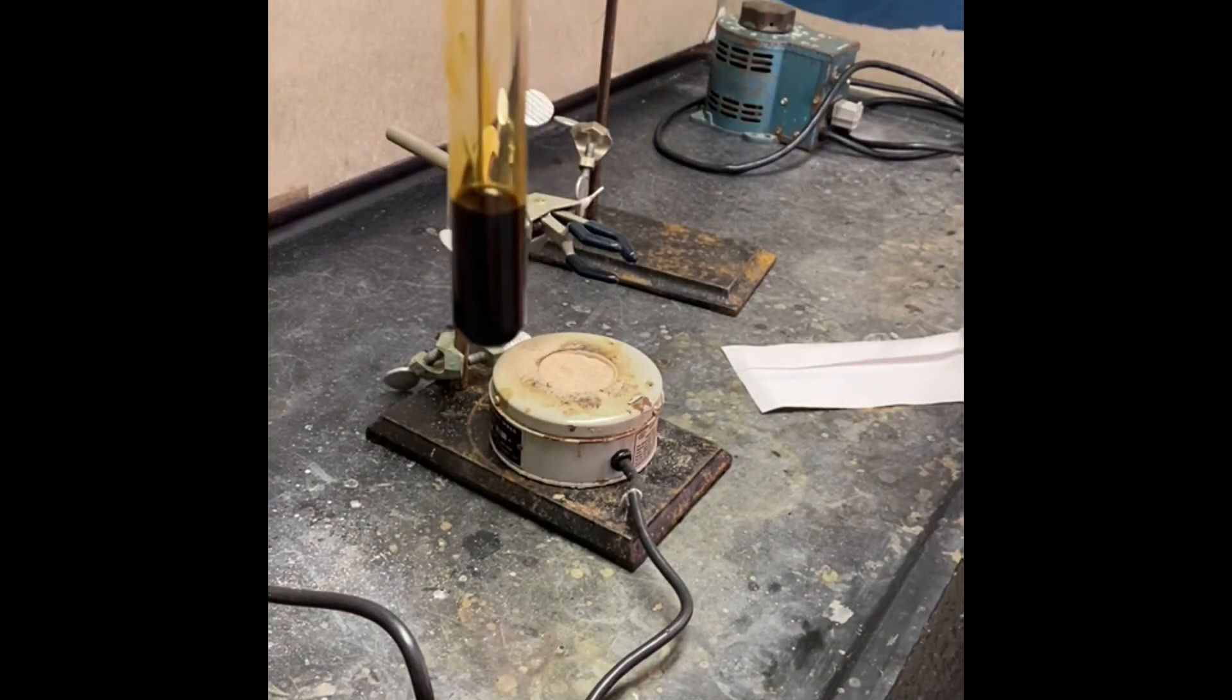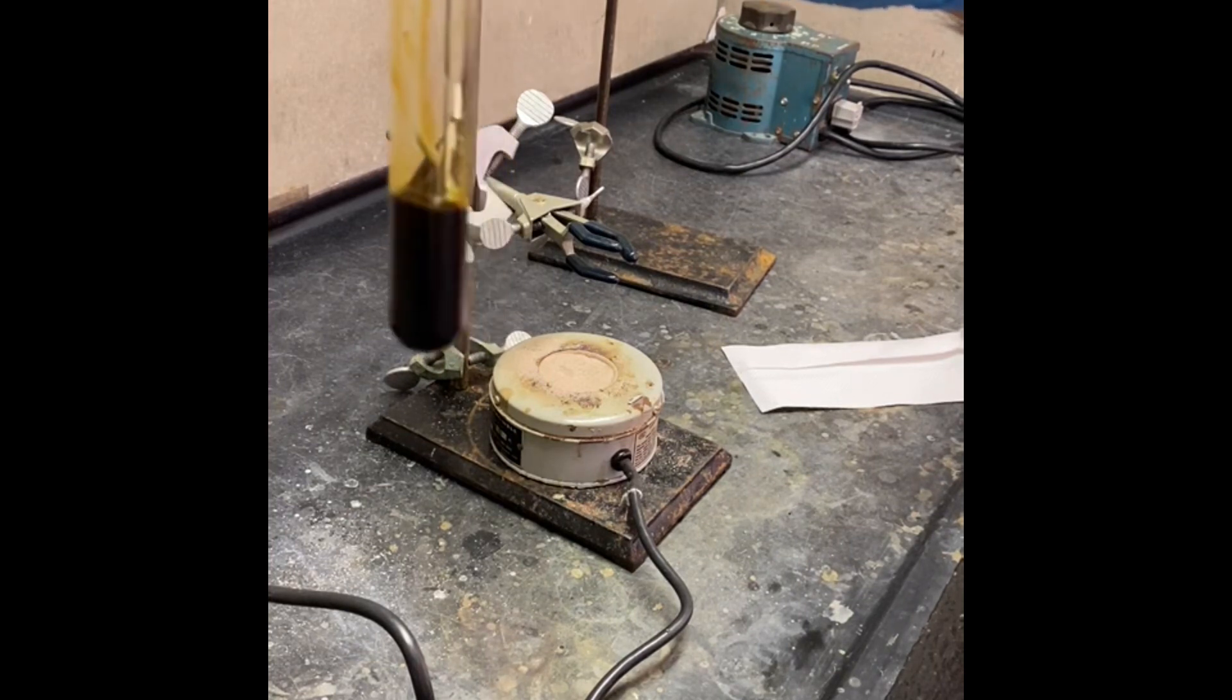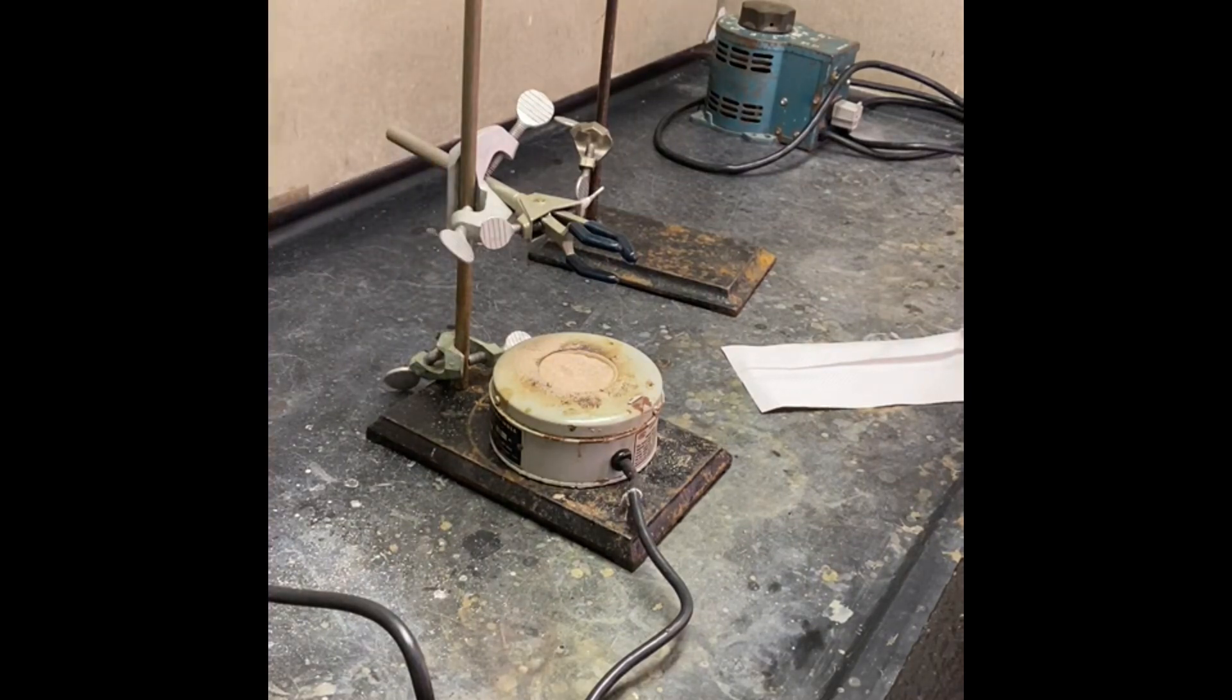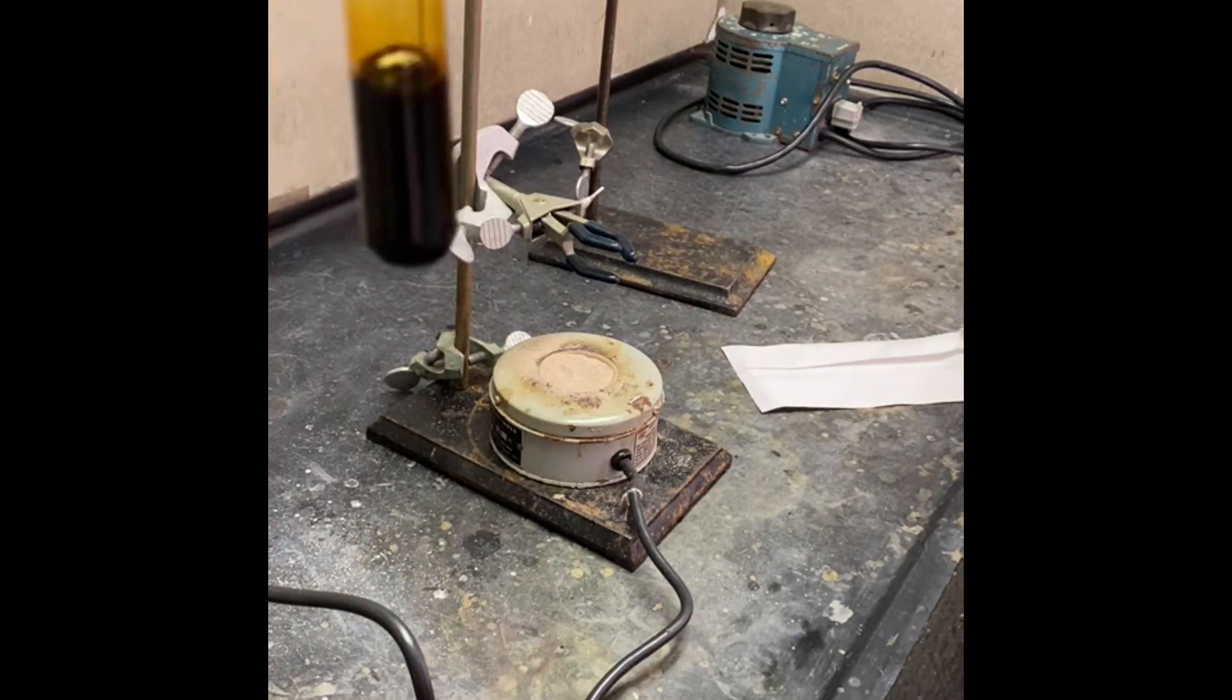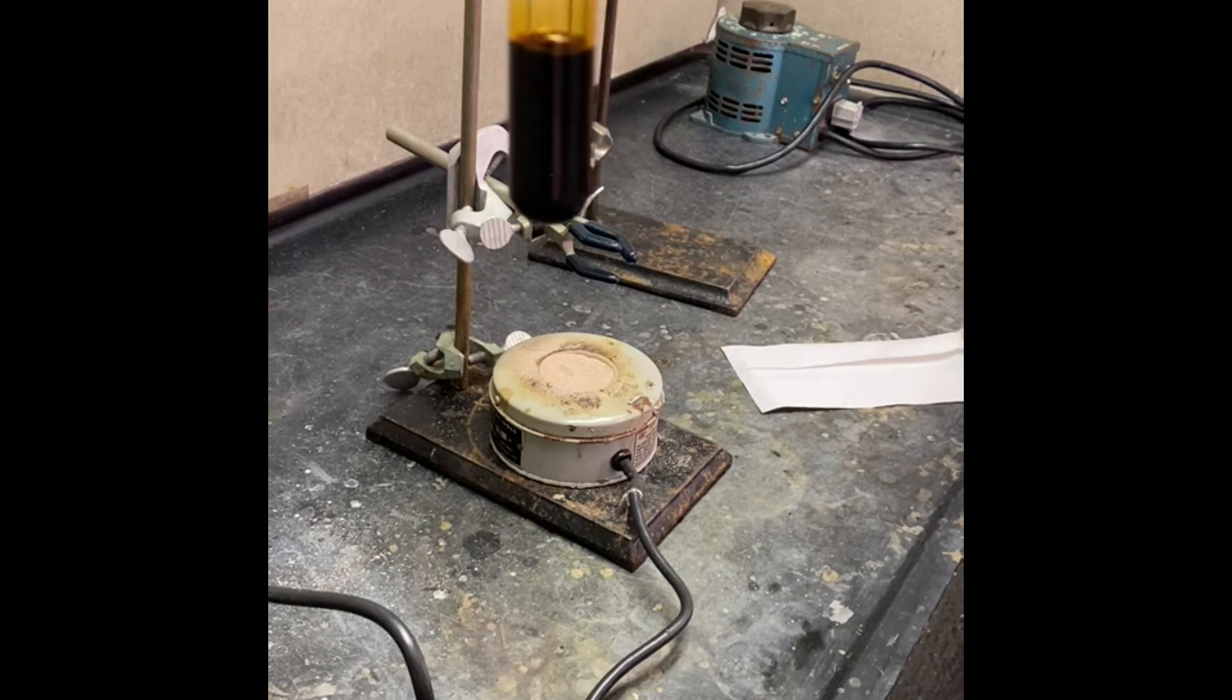We put back to the same reaction flask the first reaction product and added 5 mL sodium hydroxide. As you're seeing, it's a dark color now. In the tube right now I have the first reaction product and 5 mL sodium hydroxide.